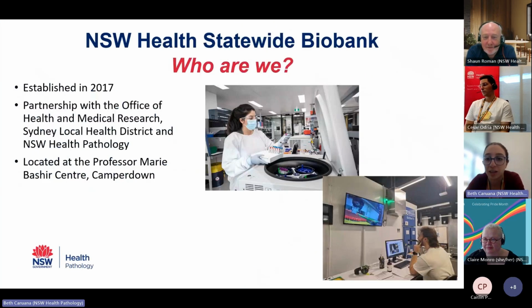But before we get into all that, for those that don't know who we are, we at the statewide Biobank are a rather newer part of the organisation, established in 2017 with a partnership with the Office of Health and Medical Research, Sydney Local Health District and New South Wales Health Pathology.